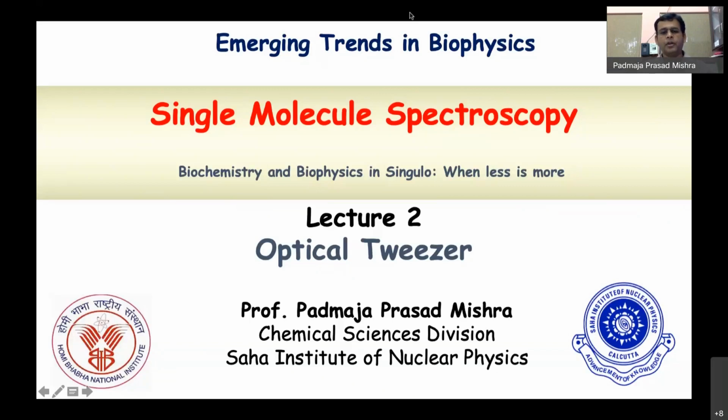So today we'll talk about optical tweezer, where I'll discuss what exactly optical tweezer is and what the functions of optical tweezer are. Mostly so far we have known that light is used to visualize things, but here I'll discuss how you can use light to hold small objects, and to manipulate small objects even. When I say manipulate, it means moving objects from one place to another place.